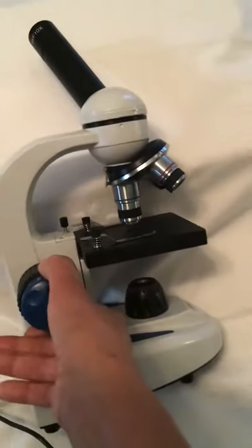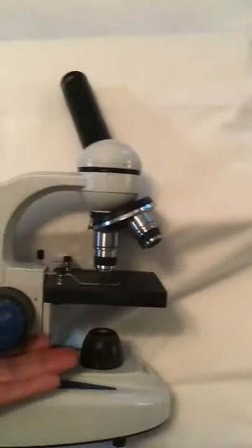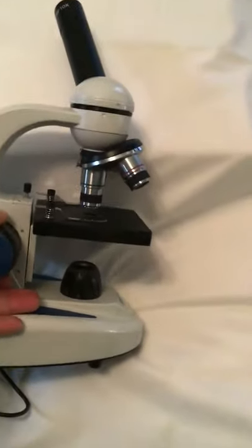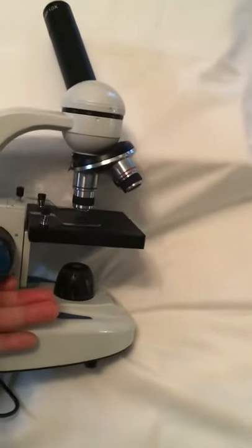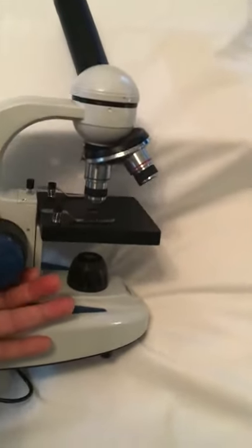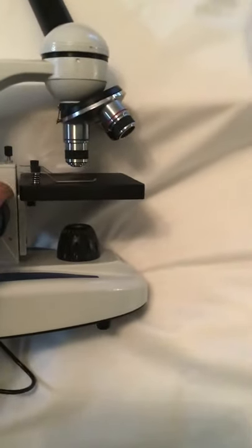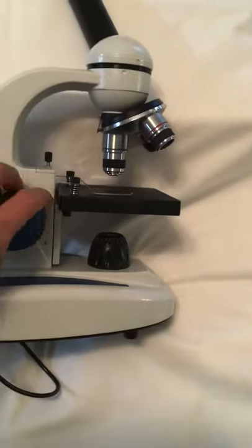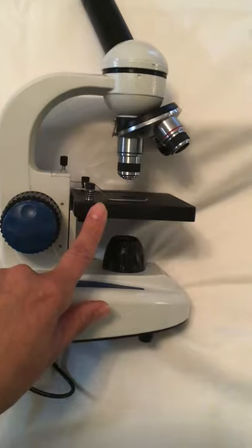I'm going to demonstrate the coarse adjustment. So I've got this laying on its side, but here you can see the stage is coming down. This is called the coarse adjustment because it changes the course of the stage.